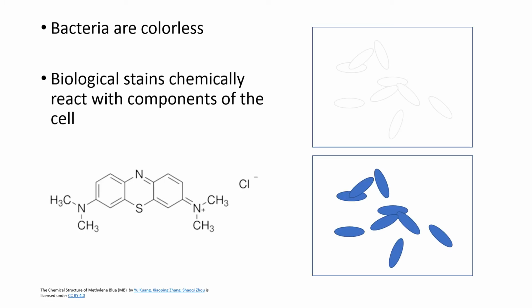Bacteria are colorless cells. I know. By now you've seen red or yellow colonies, maybe even pink ones. That color is from a pigment that the bacteria make and then secrete into their environment. The cells themselves have no color. This means that if we want to look at bacteria under a microscope, we need to add color.